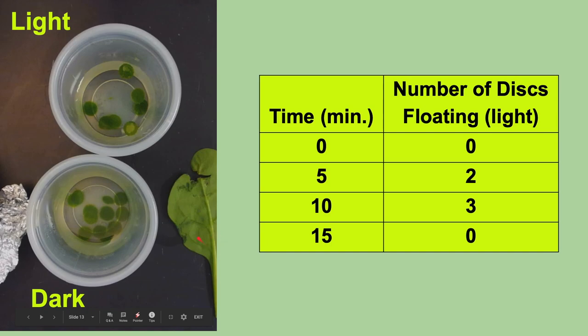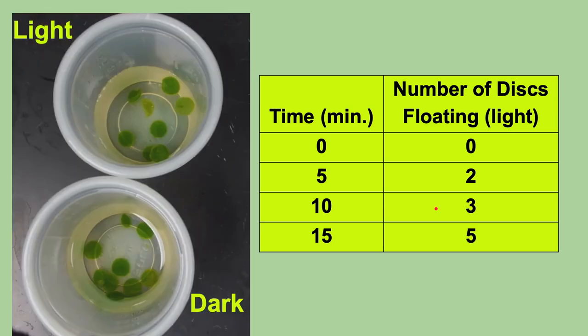And wow, what happens? Now we have three disks floating. You can count them - one, two, three. And in the dark, there's still none. We peeked in, we don't see anything floating. We record that in our data table. And then what's going to happen is after 15 minutes, we have five disks floating.